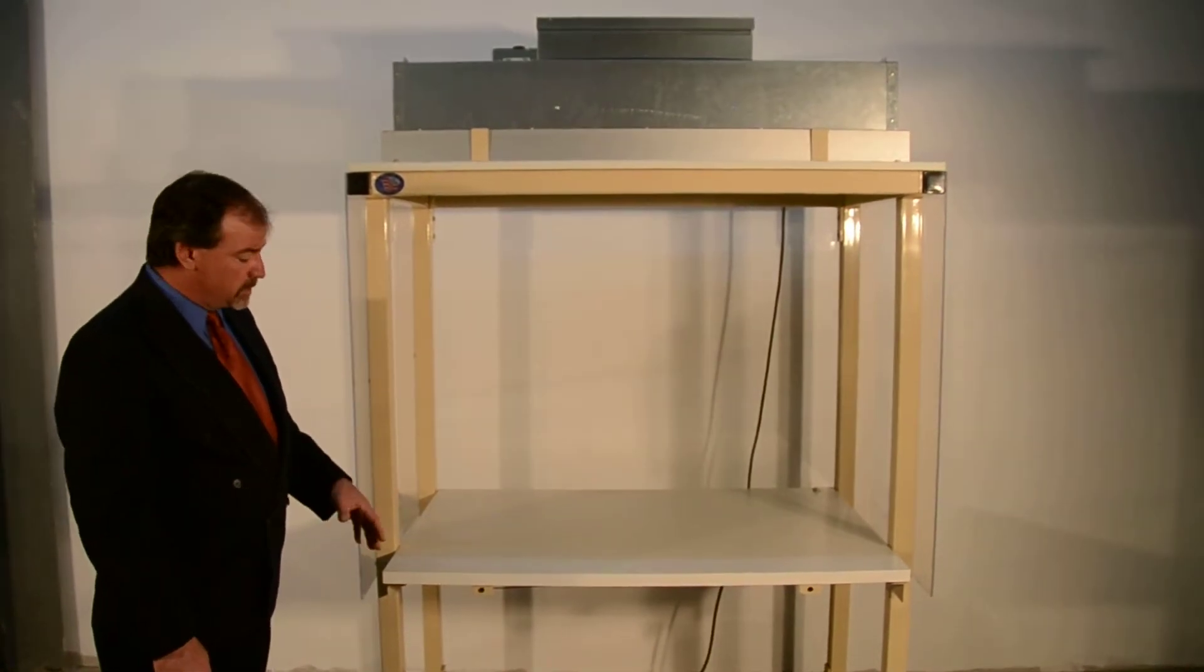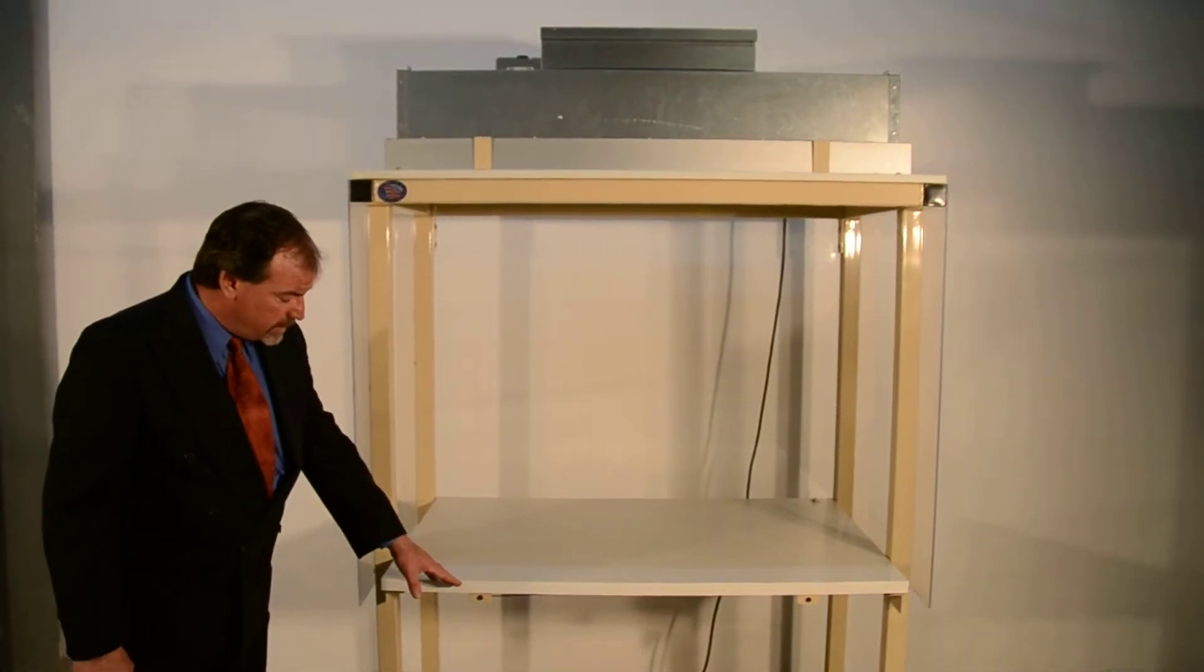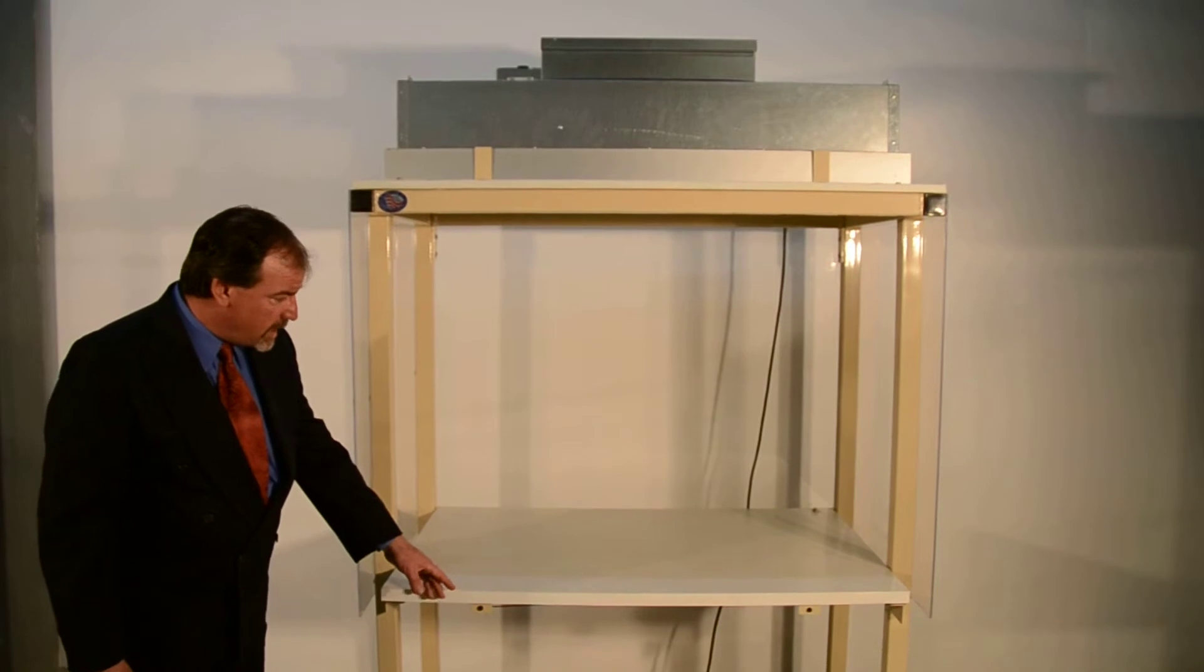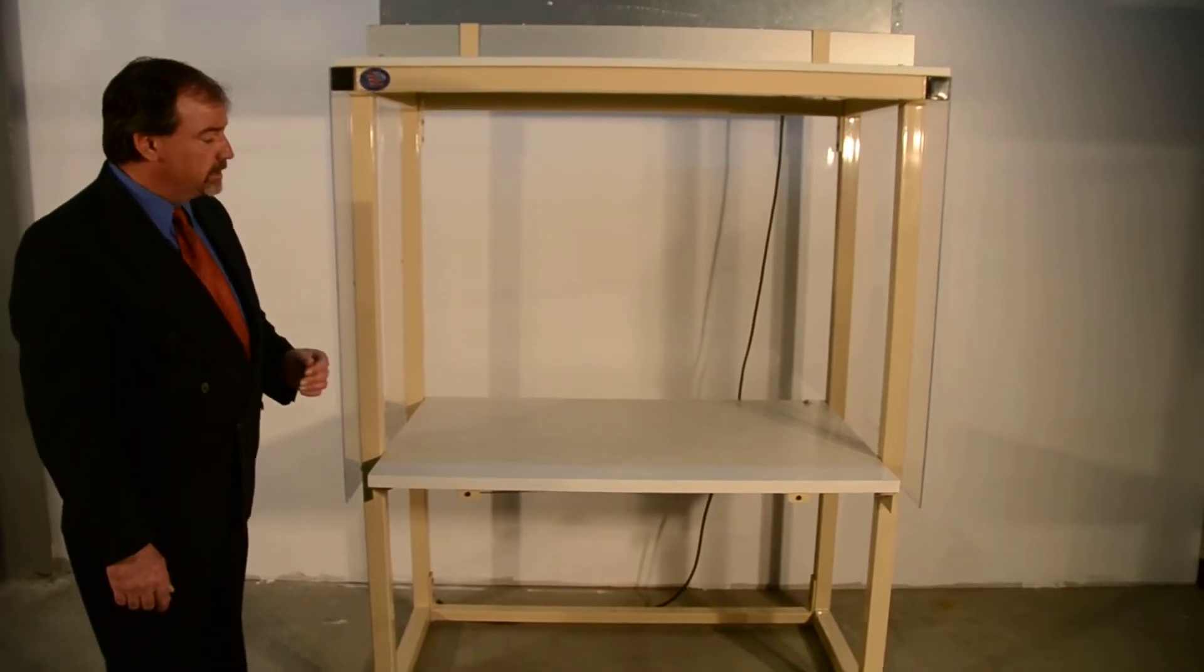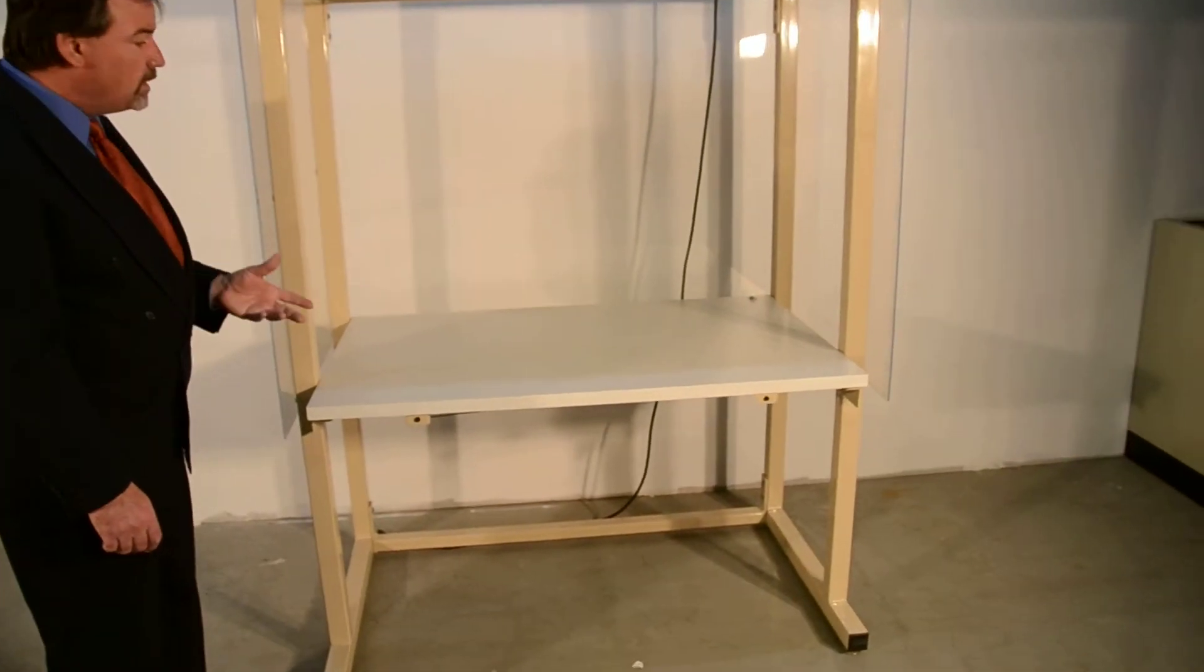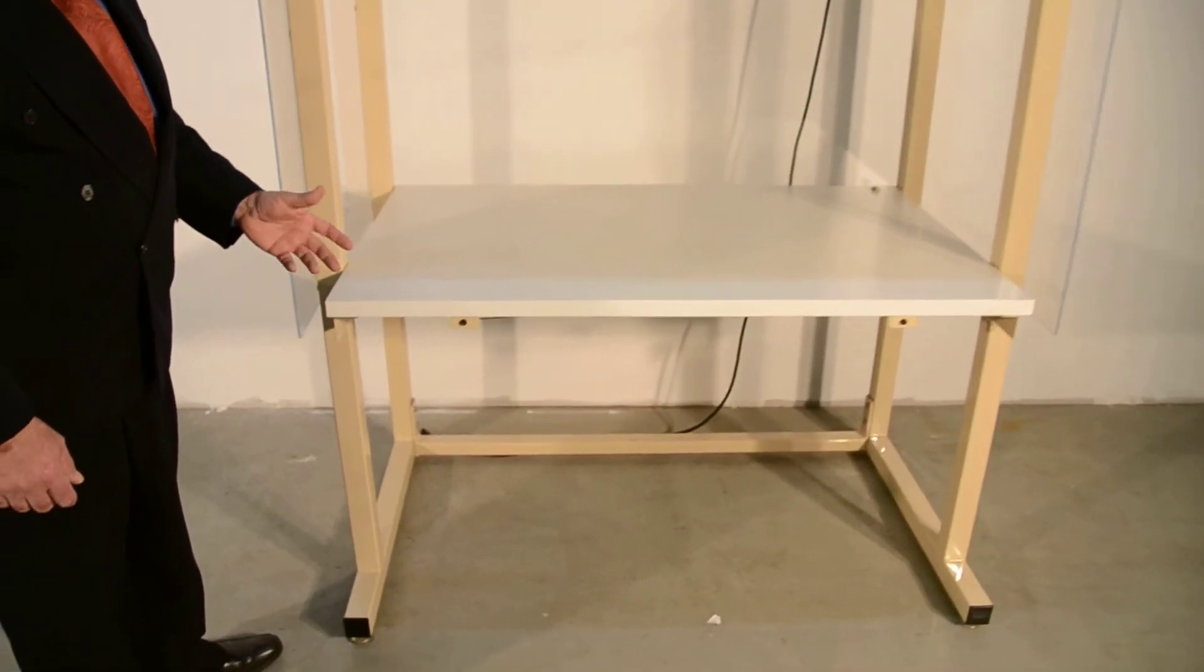In this particular model, we're also showing our ESD laminate work surface with grounding kit that includes a banana jack, the ground kit and lug, and then a wire that runs out to building ground. The reason that's important is you don't want any static electricity where the dust might collect onto anything.